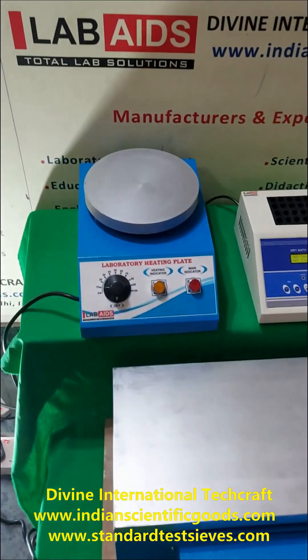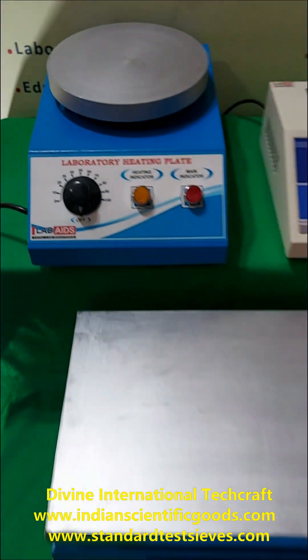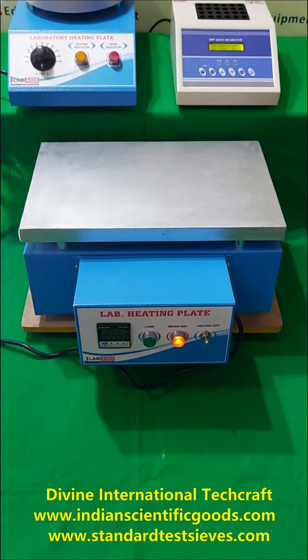We offer round hot plates with 8 inch diameter and also rectangular hot plates in various sizes.